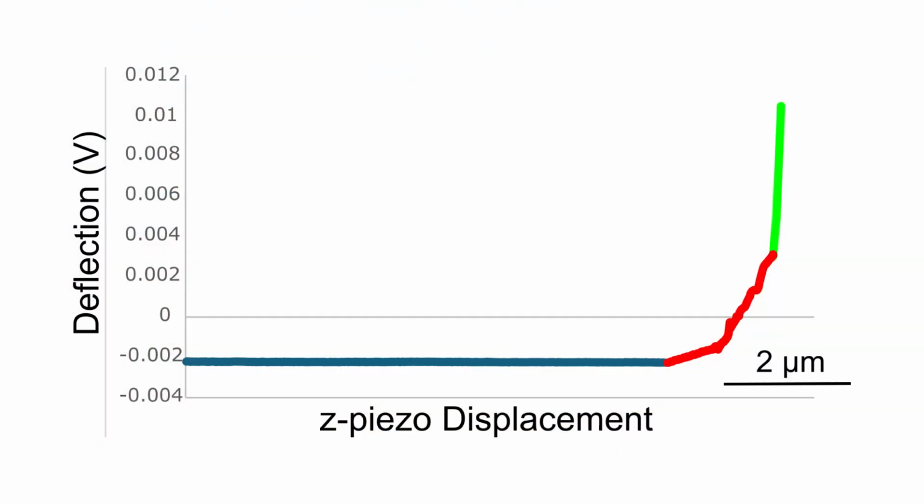Without the FusionScope, without the profile view, it was not even possible to see this exactly. And we can see this also in the force distance curve. When we now have the force distance curve here, you can clearly see two different regions in this force distance curve, which we can match to this video. And this is a real big benefit of the FusionScope.